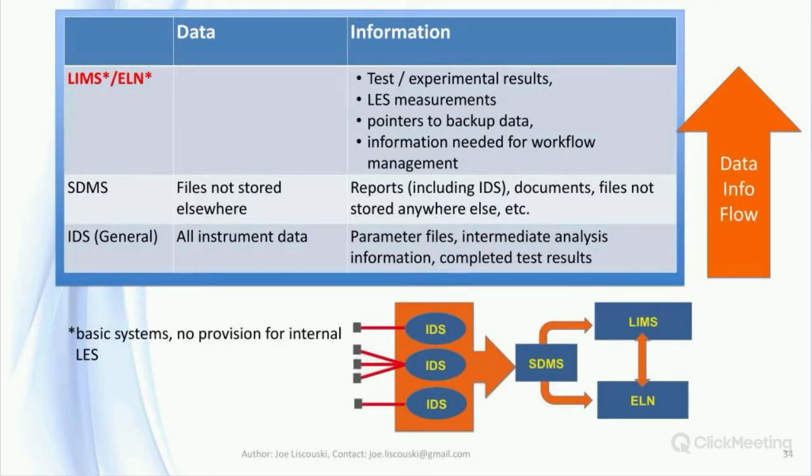This is just one possible layout for distributing lab data, information, and procedures and reports. The LIMS or ELN or additional systems might carry accounting or personnel information. While the primary subject of this webinar is the instrument data system, we can't treat it in isolation. The links between it and other systems have to be taken into account so that the flow of data and information is well defined. And as we've noted, all systems need backup support.